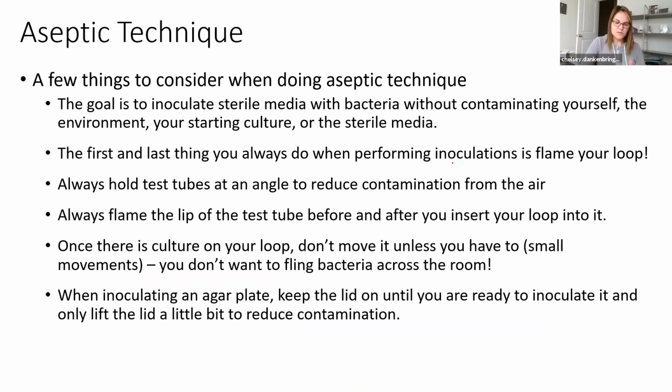So I am going to demo for you what's on this slide and what's spelled out in the aseptic transfer handout. Okay, so now we're going to pretend that this is my starting culture. Pretend it's a broth of E. coli. This pen is going to be my inoculating loop. You hold it like a pencil, okay? Now use your imagination and pretend there is still a Bunsen burner here.